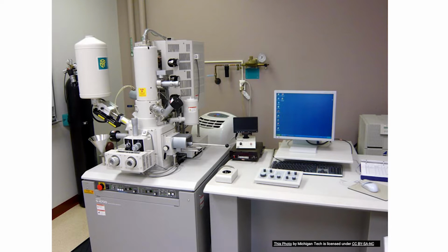Our contemporary electron microscopes, on the other hand, share the basic shape, but as expected, they are highly connected to computers or digital equipment. I don't think I mentioned this last time, that even light microscopes nowadays are mostly digital microscopes, especially the ones that you would find in well-funded research labs. So, in some textbooks, they have a category on digital microscopes. I don't think that's necessary. Most microscopes, if not all of them, are going to be digital.